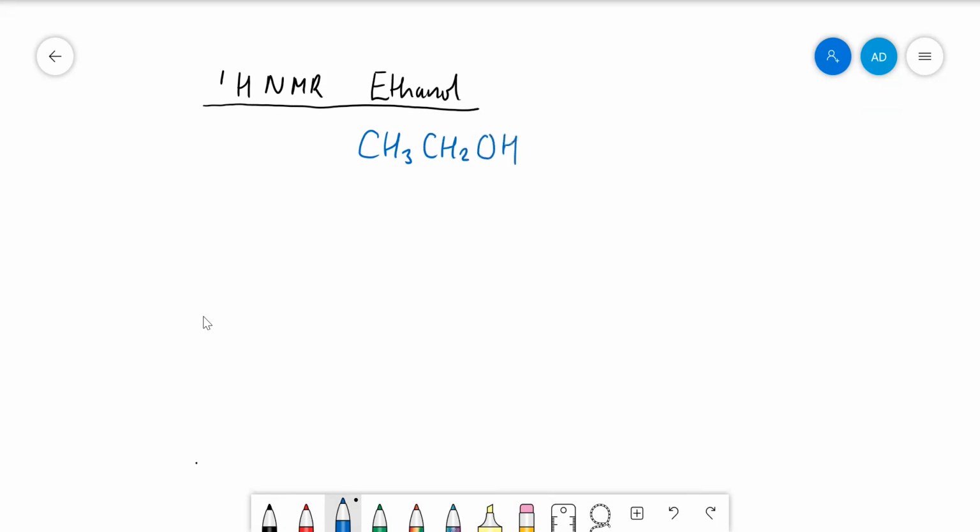Now, if you look at the spectrum, on this axis, which will be marked in ppm, and don't forget what is really happening here as we go in that direction, increasing the magnetic field strength.